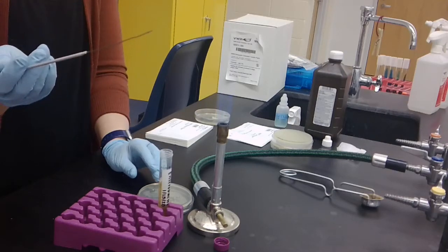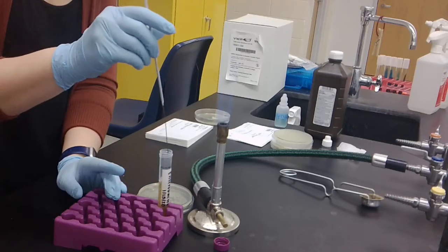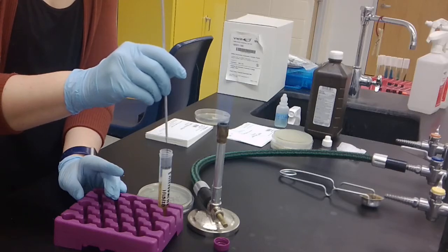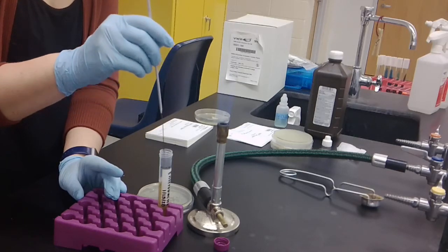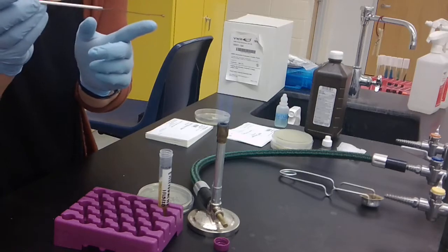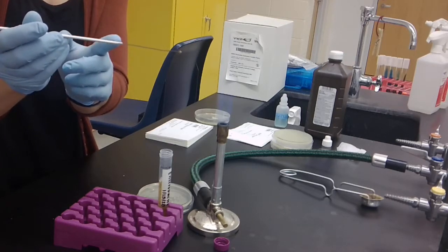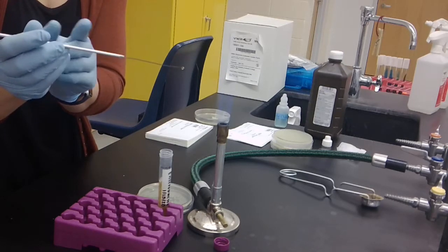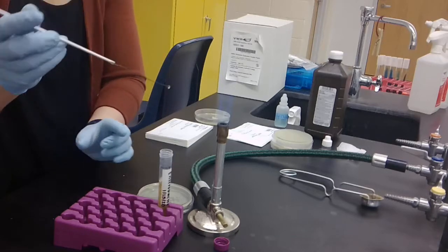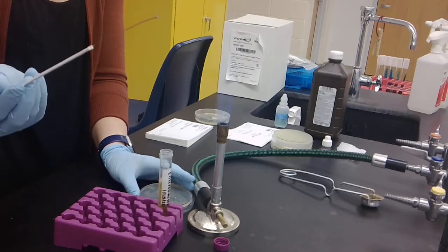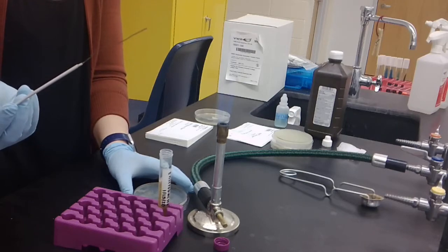You're then going to take your incinerated loop and dip it into your bacterial culture just enough so that the loop itself enters the culture. You sterilize the entire metal portion of your loop, but not the handle at all, so you don't want to get the handle into that tube. You only need to dip far enough to get bacteria onto the loop itself.